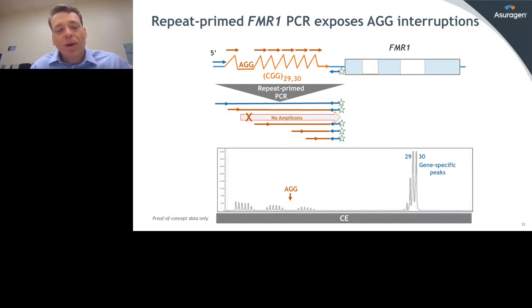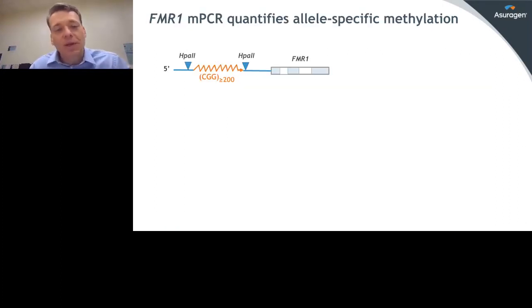Then we go into the repeat prime pattern, and as those primers kick in, you start to generate a series of these repeat prime peaks. However, once the primer runs into the AGG element, it doesn't generate a product because it won't hybridize. So now, within that mobility space, you see a gap, and that gap is associated with the AGG. Then the assay picks back up, and when you run out through that AGG, you pick up the corresponding CGG elements again and can carry forward with the interpretation. There's actually another AGG here that I didn't mark for simplicity purposes, but you get the idea.